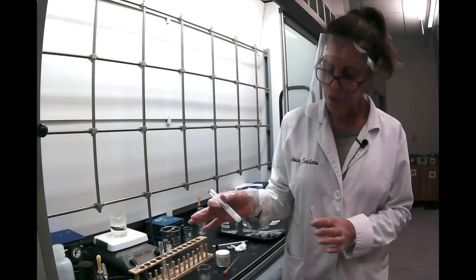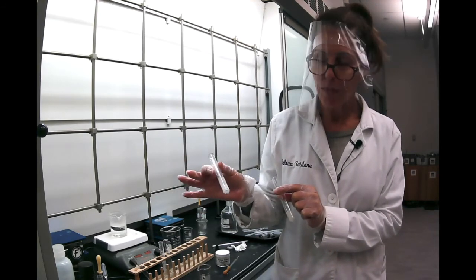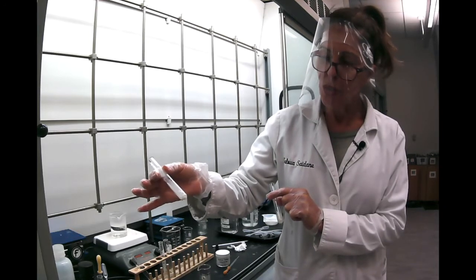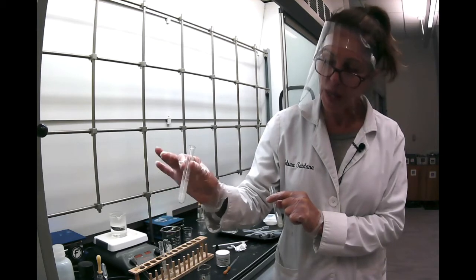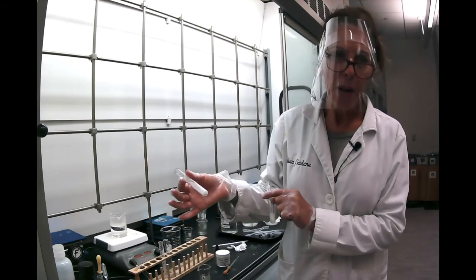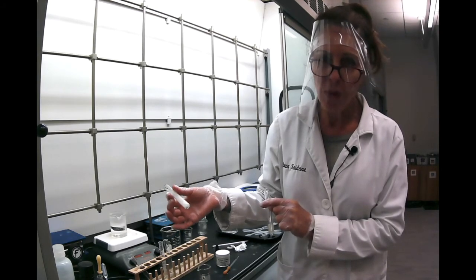So to conclude, let's look at these two test tubes which show how much benzoic acid is in the organic layer. In the passive extraction, you see that we have a good amount of benzoic acid, which shows that benzoic acid dissolves in methylene chloride. That's the reason we have some of it here. And of course, if we evaporated the water, we could also know how much benzoic acid was in the water. But by just subtracting what you put in at the beginning and what you have left here, you pretty much have an idea of how much benzoic acid is in the water layer.